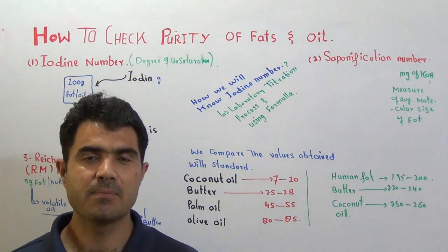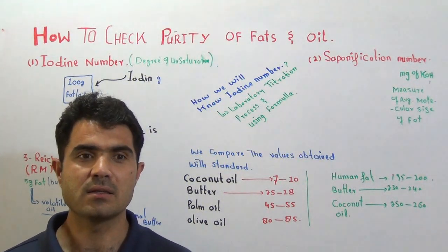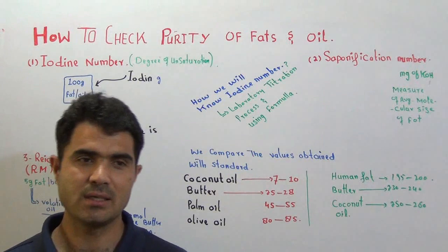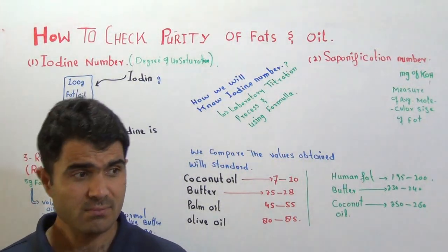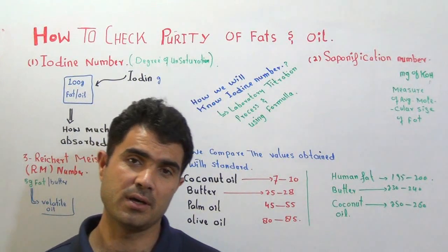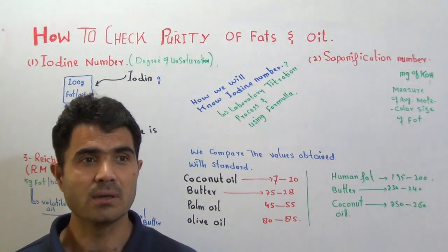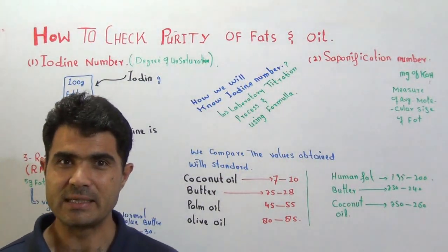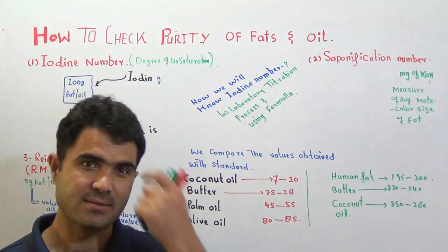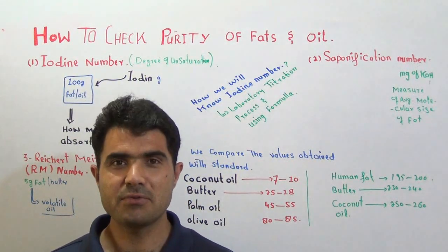We can check the fats and oil, whether they are pure or not, whether some changes have been done in them or not. So it is also important for the students to know. Maybe sometime they become an expert in a lab to check these sorts of tests. So let's start with the first one.